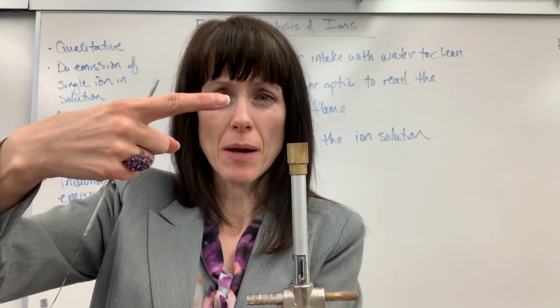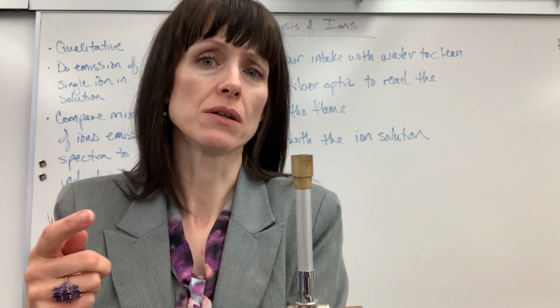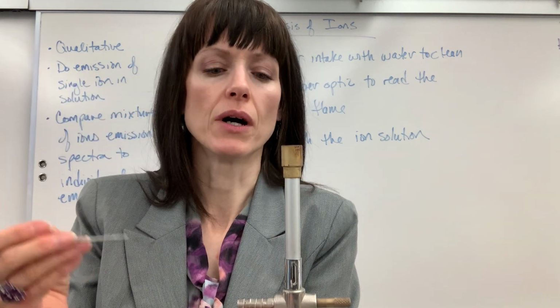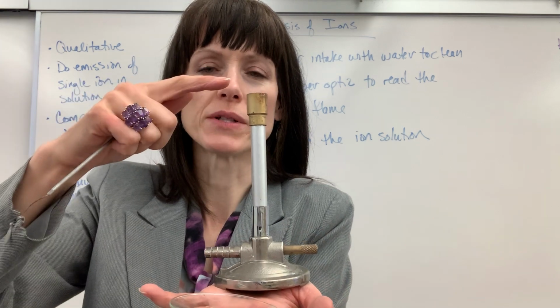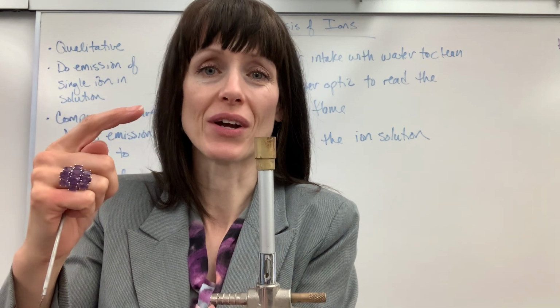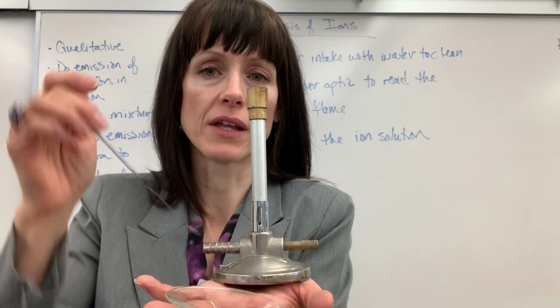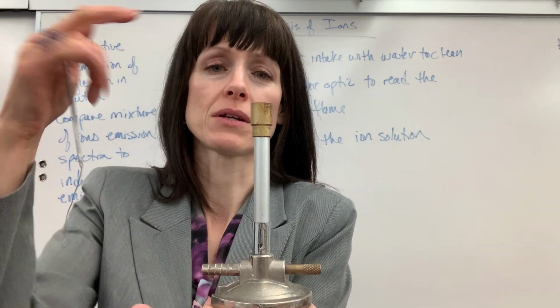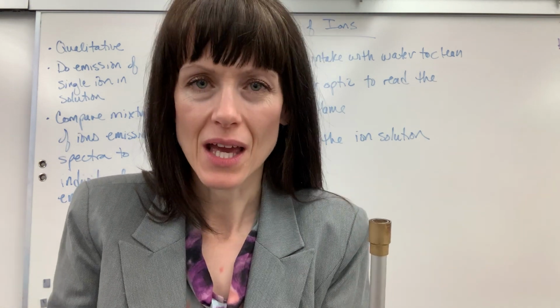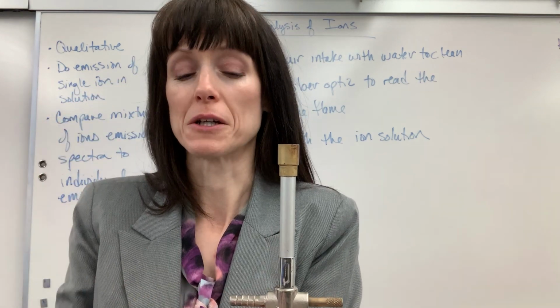Here's the deal though, the fiber optic has to read it. It depends on your system. The system that we used at the university where I worked, it took 2 people to do it. One person would do the splattering and one person would push read, that it would have to record it. It wasn't constantly reading. You had to tell the fiber optic when to read. So it took 2 people, one to splatter and the other one to push the button for the fiber optic right here to read that color. So your lab TA, your teacher, professor, they'll show you how the fiber optic will read the color.